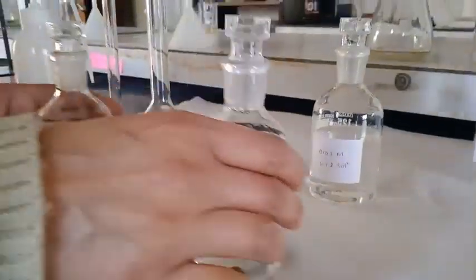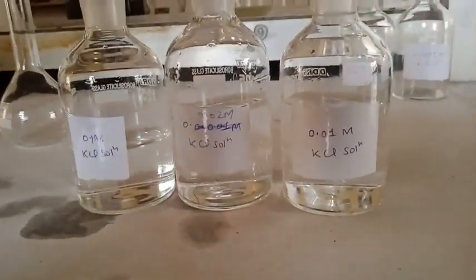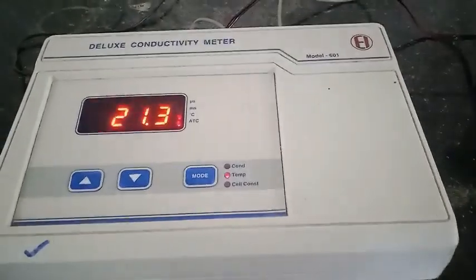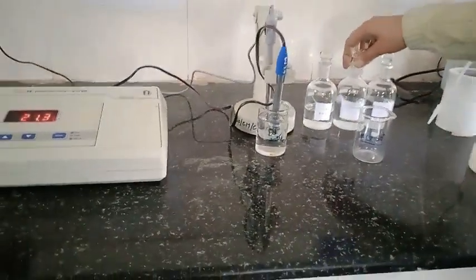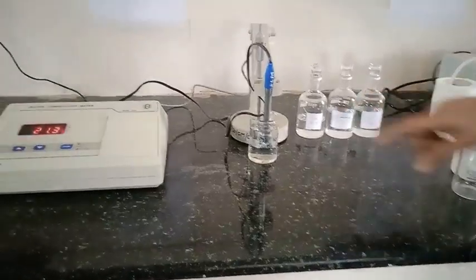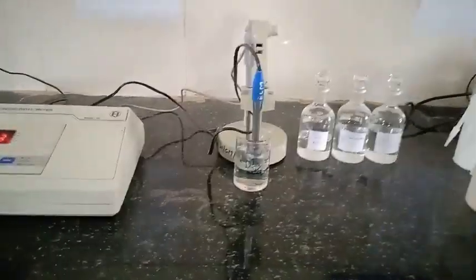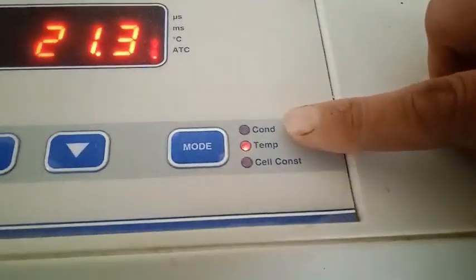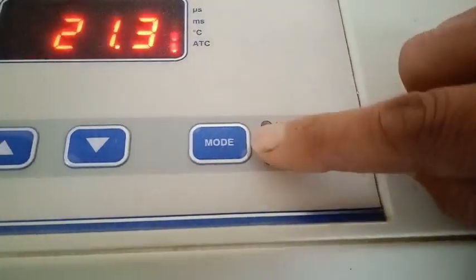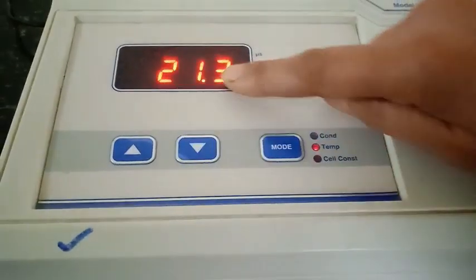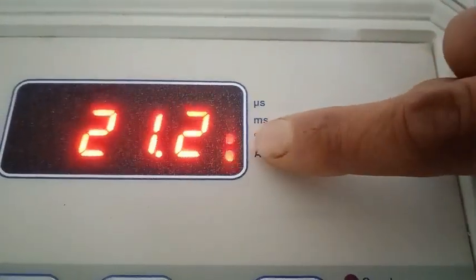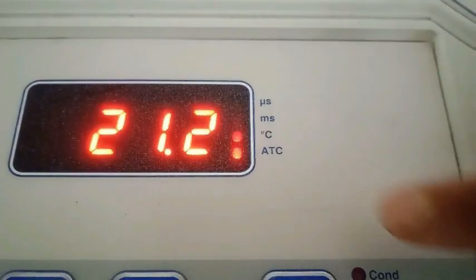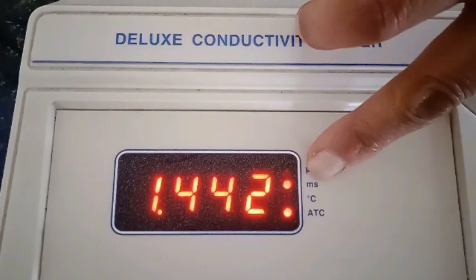I have prepared three different solutions for three different ranges. Here you can see these are the solutions prepared for the calibration of the conductivity bridge. Here is the conductivity bridge, and here is the conductivity cell dipped into the beaker — this blue one. The conductivity bridge has three different modes: conductance, temperature, and cell constant. Temperature is currently active because the light is blinking. The temperature is 21.3 degrees centigrade today. ATC means automatic temperature controller. The cell constant is given as 1, and conductance is displayed in either microsiemens or millisiemens — currently in microsiemens because that LED is blinking.